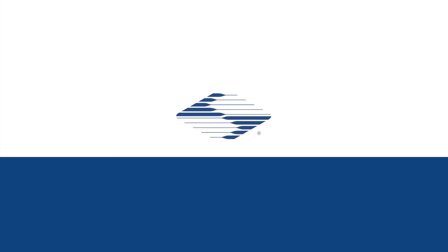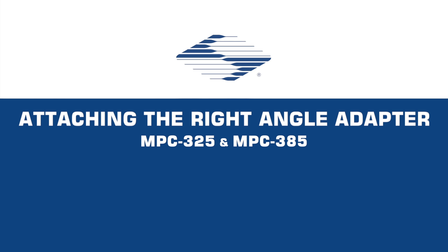Hello, and welcome to another Sutter Instrument video tutorial. This video will cover the right angle adapter installation on either the MP225 or MP285 micromanipulator when used with the MPC200 controller.